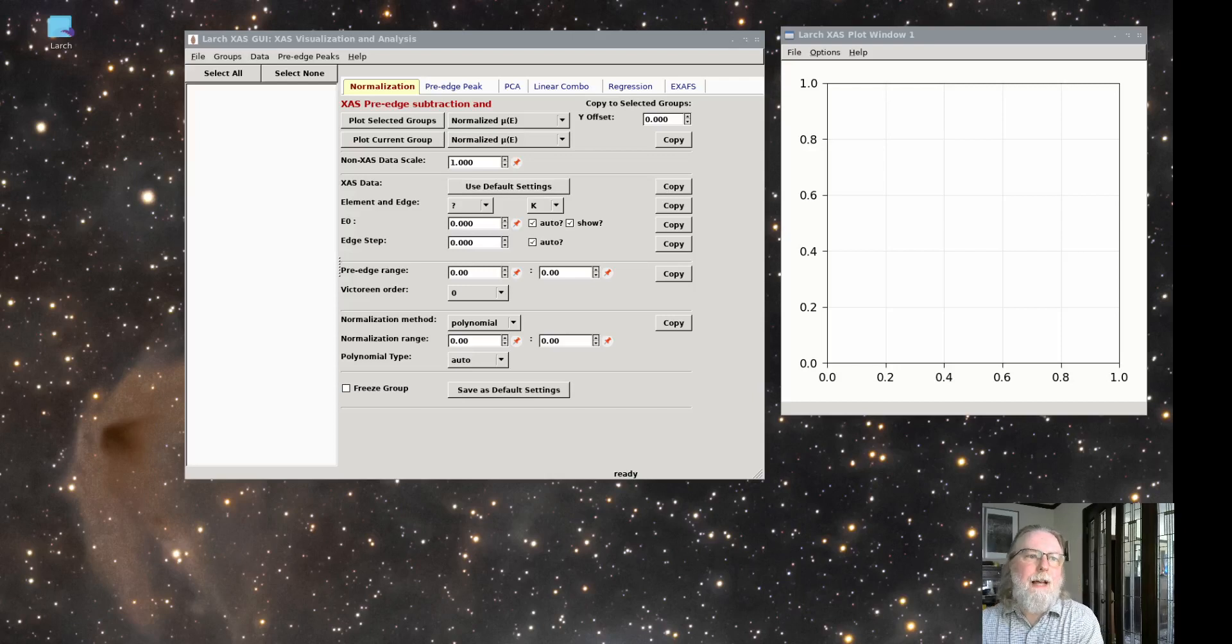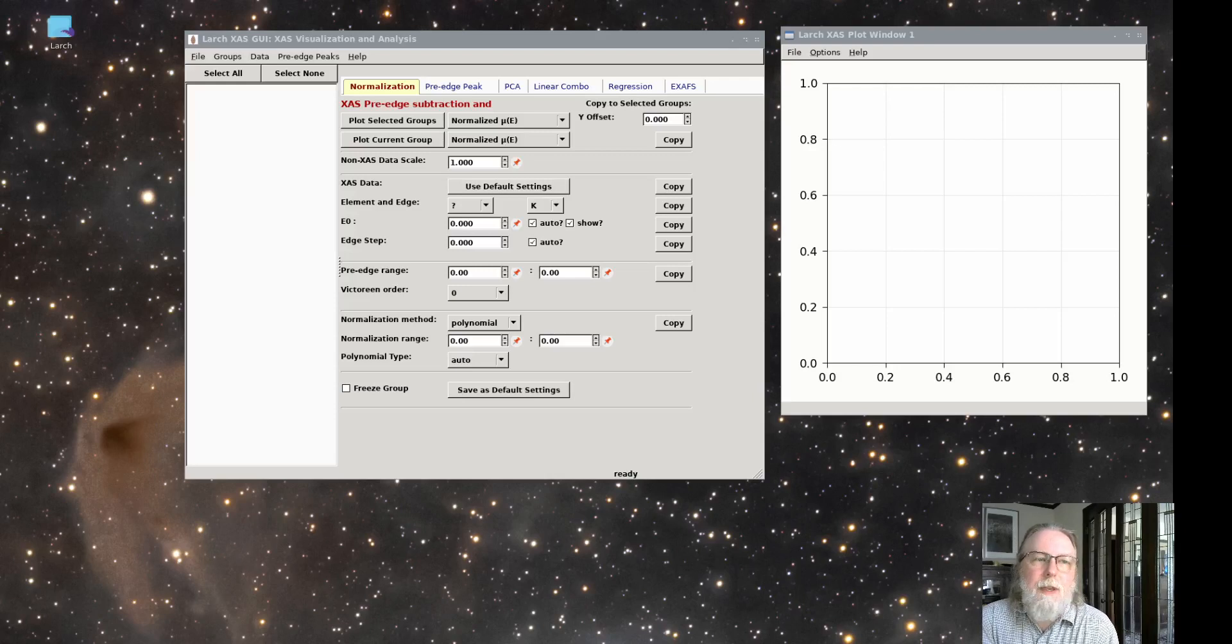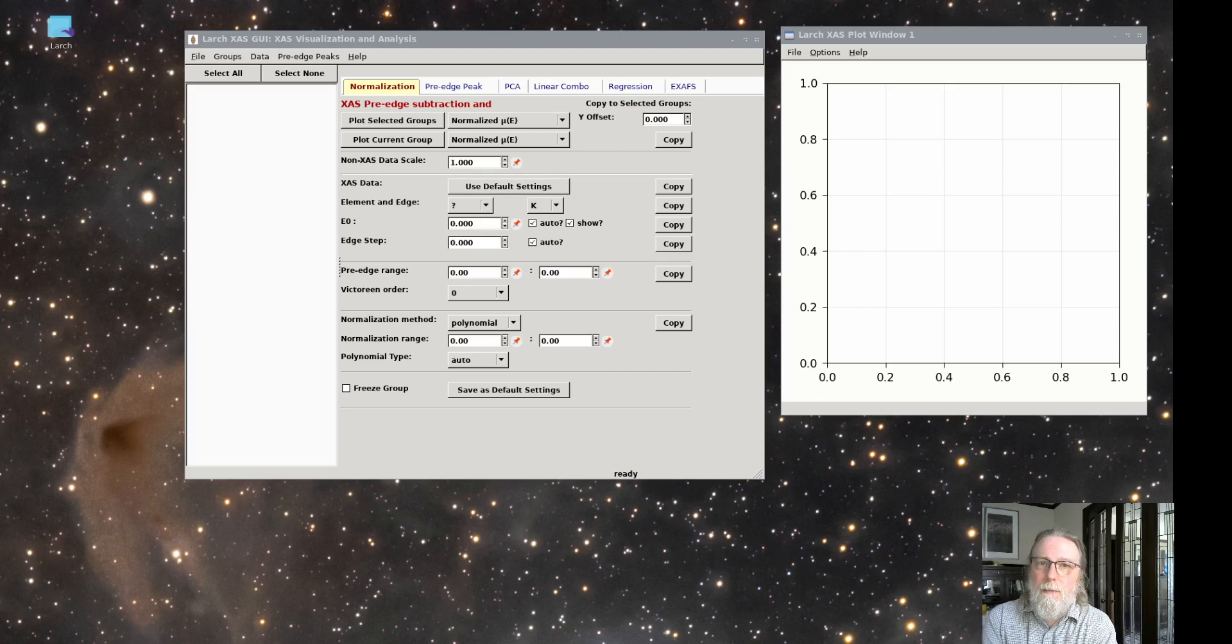The first real task for any XFS analysis is to normalize the raw XFS data so that it represents a unit edge step for the absorbing atom. Doing this well is important for all further analysis.